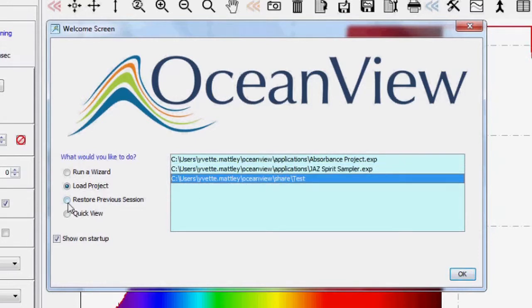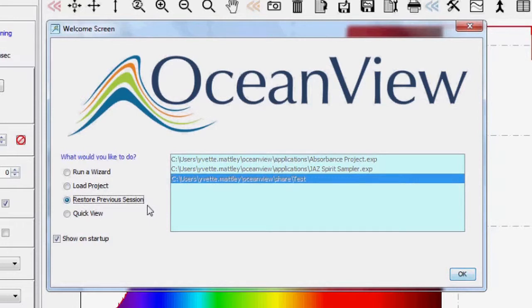Choose Restore Previous Session to reload the software exactly as you left it during your last measurement session.